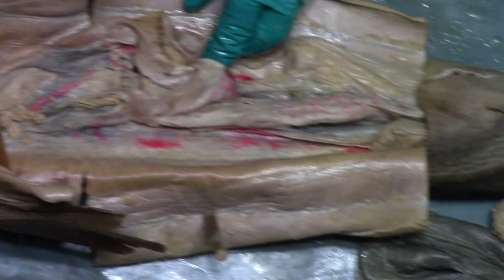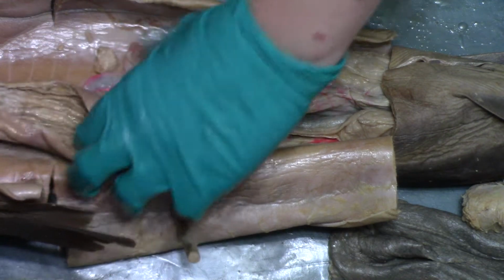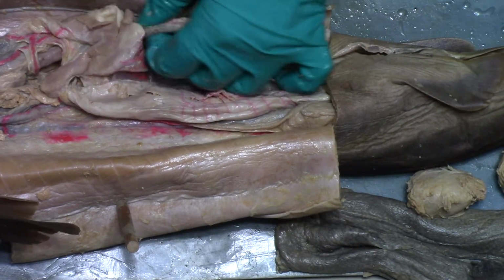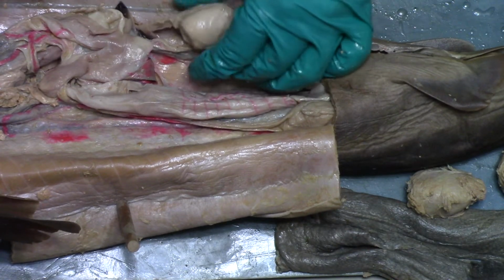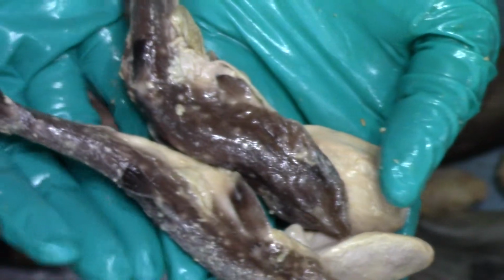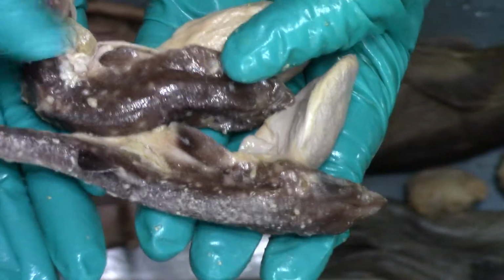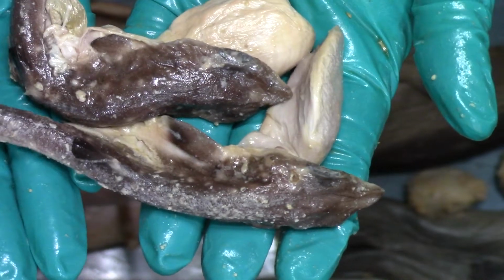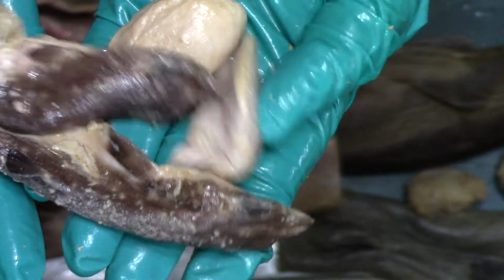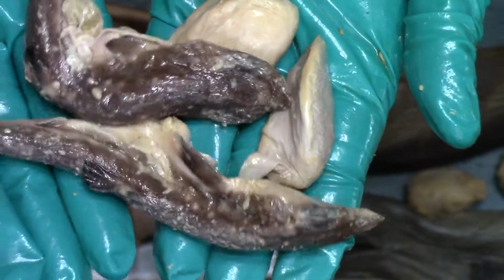Does that mean there's another one? So like we had those egg yolk sacs up by the head, and then as we move down, oh, here's another one. We're gonna birth another baby shark down here. Probably attached to that egg sac. Oh, there's two more. Just pulled two more baby sharks out of her uterus, vaginal canal. They both still have yolk sacs. They're not quite ready to be birthed yet. But they'll keep using up the energy in that yolk sac until it's time to be born. But they're pretty far developed.